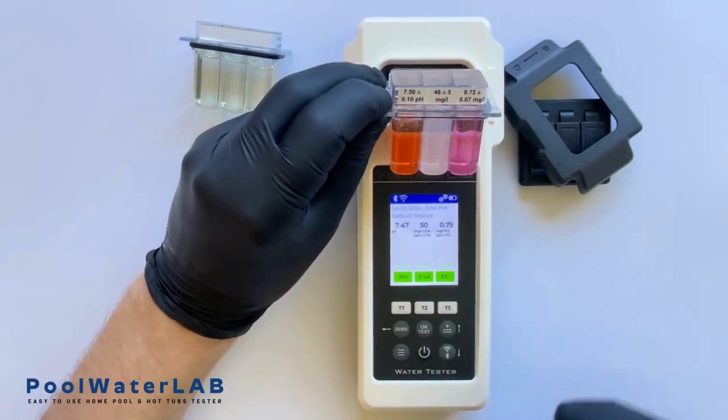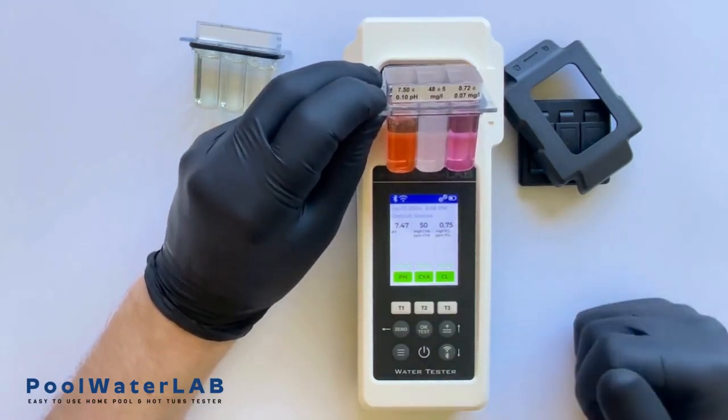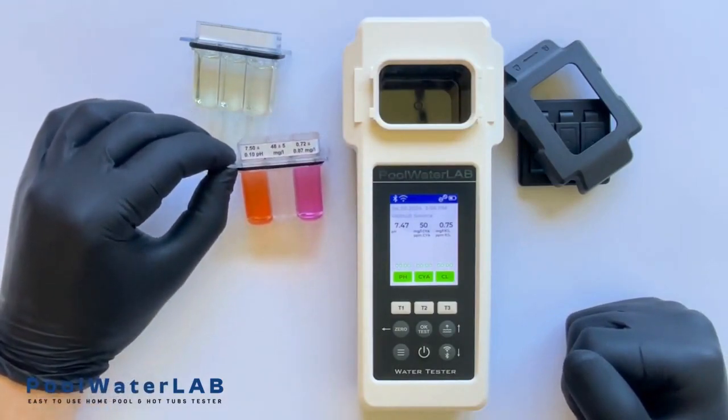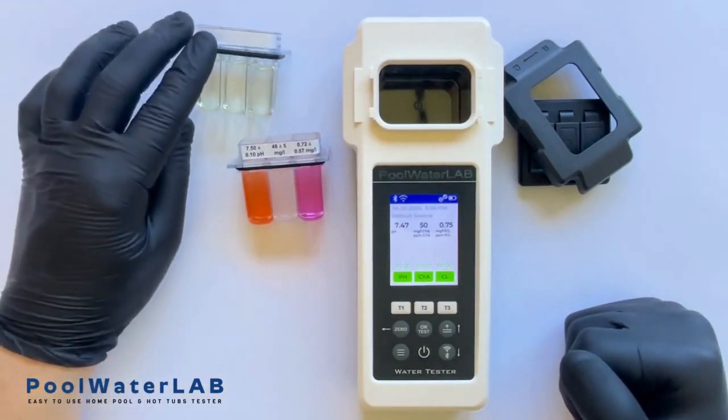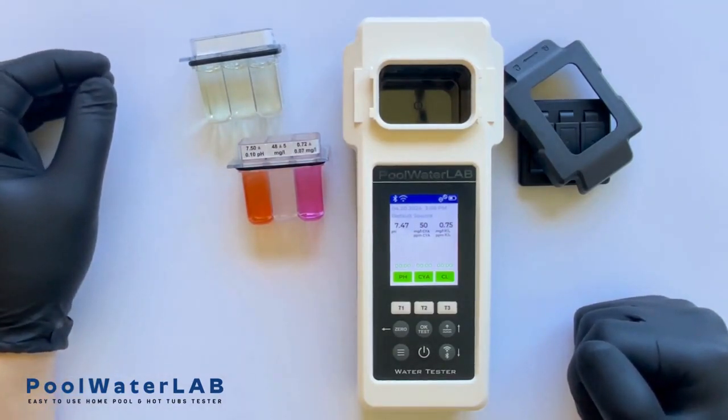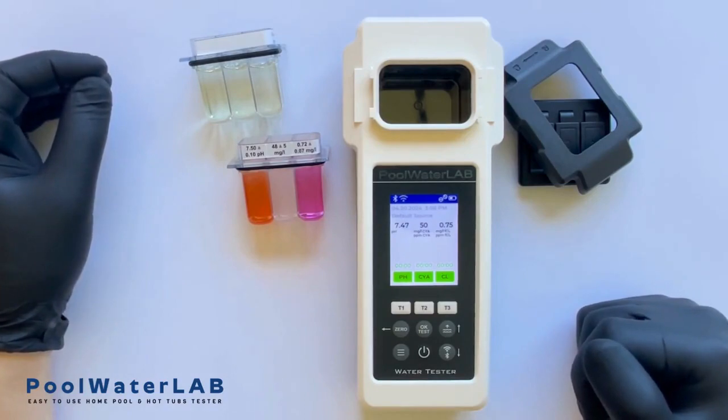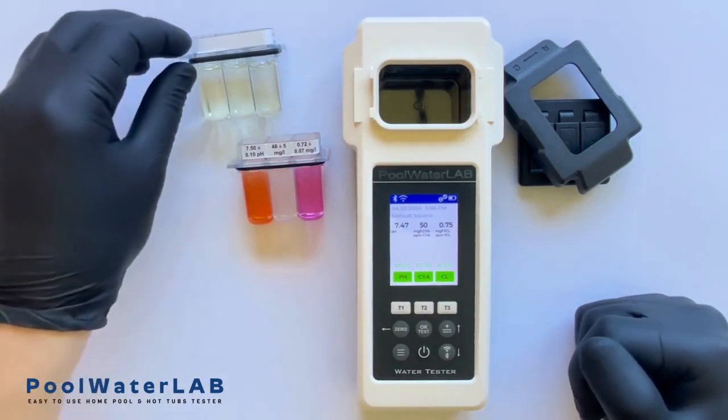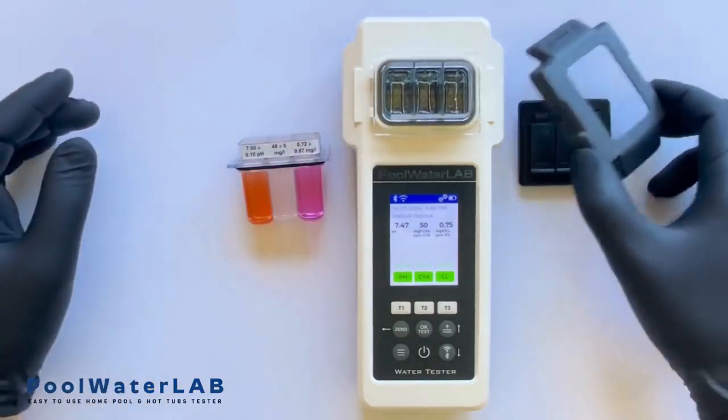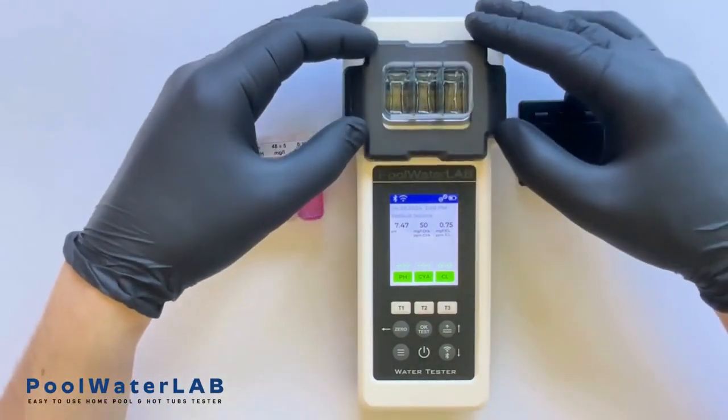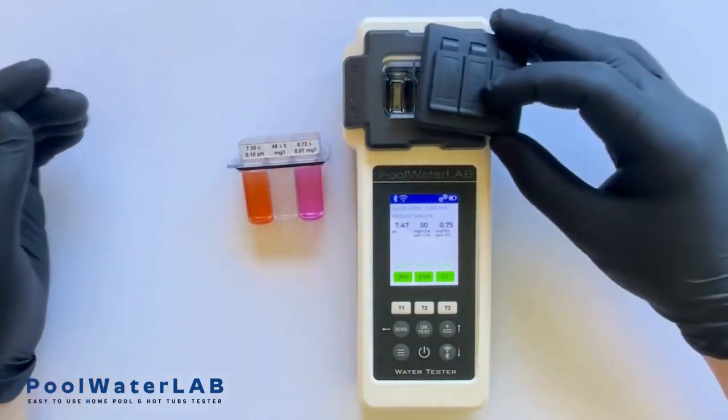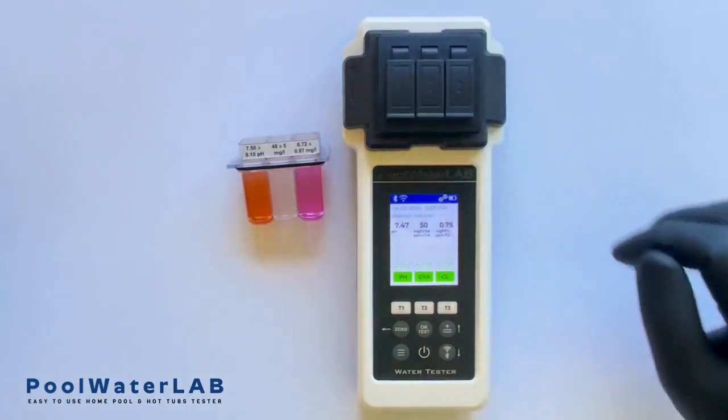Therefore, we can conclude that the pool water lab tester fully complies with the L1 accuracy level, which is the generally accepted standard for water measuring devices in the USA. The L1 standard is a rigorous benchmark that ensures devices can deliver consistent and reliable results under a variety of testing conditions. It requires devices to demonstrate a high level of precision, with only minimal acceptable deviations from the established norms, thus ensuring both reliability and accuracy for critical water quality assessments.